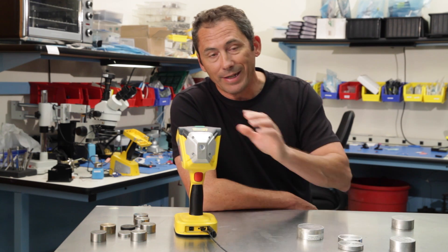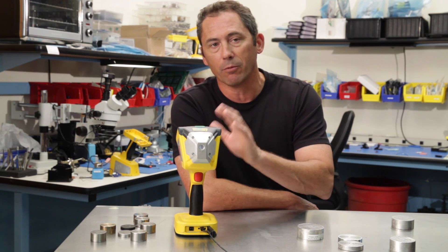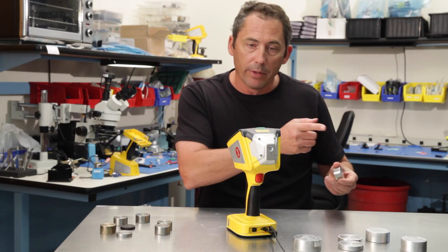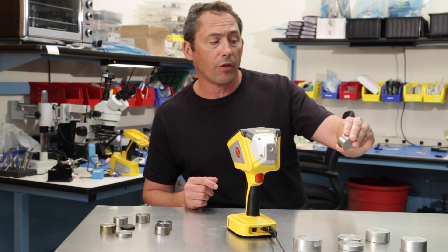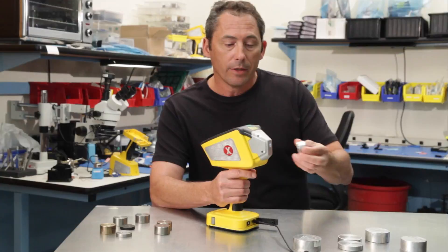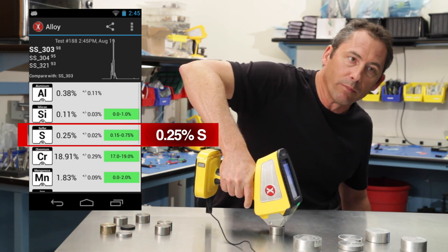So it's not just an incremental improvement in X-ray technology — this is completely new signal processing electronics and we're the only ones that have it, at least for now. And the speed is a great example. It's not just the aluminums that are really fast with this new two-beam technology. Here's a stainless 303 — the only difference between 303 and 304 is a little bit of sulfur in 303. I set the unit up to do a total five-second test. There's the first beam: it's either 304 or 303. Now you've got the sulfur — in under five seconds we're measuring the sulfur in a 303.